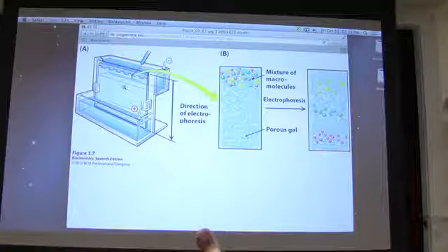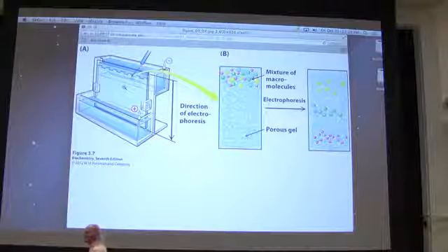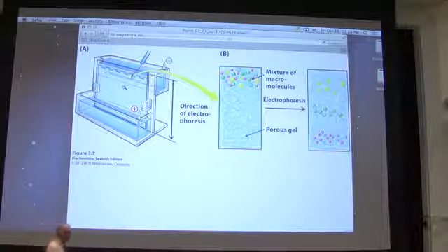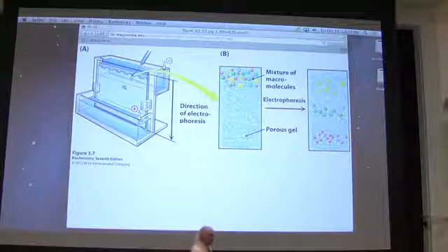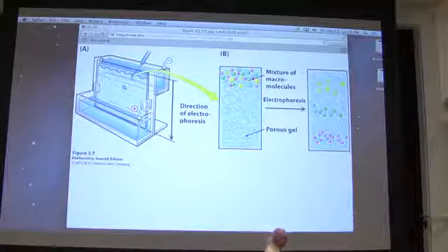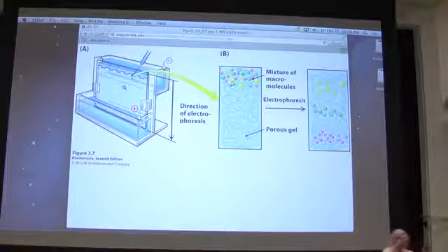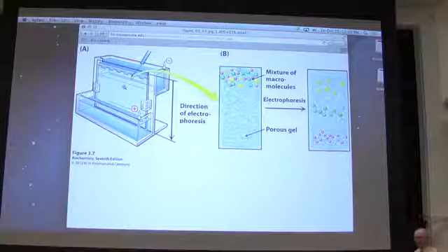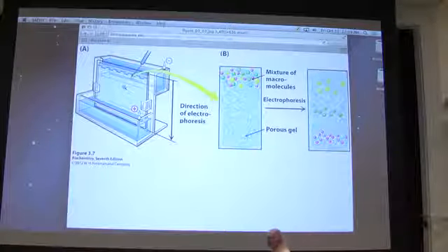All right? Polyacrylamide gel electrophoresis uses a polymer of a monomer called acrylamide. It makes the gel that you actually see right here. And like I said, agarose gels look very similar. The primary difference for our purposes is that polyacrylamide also makes a mesh and leaves holes for things to travel through. The difference is the holes are much smaller than they are in agarose gel electrophoresis.